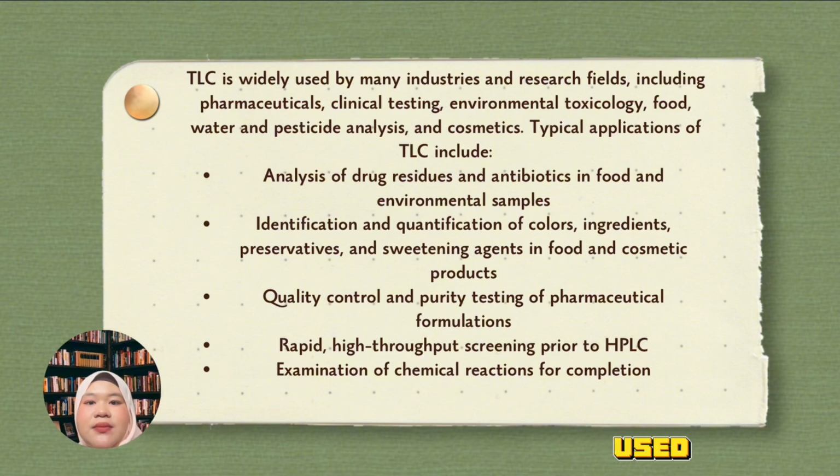TLC is widely used by many industries and research fields, including pharmaceuticals, clinical testing, environmental toxicology, food, water, and pesticide analysis, and cosmetics. Typical applications of TLC include: first, analysis of drug residues and antibiotics in food and environmental samples. Second, identification and quantification of colors, ingredients, preservatives, and sweetening agents in food and cosmetic products. Third, quality control and purity testing of pharmaceutical formulations. Fourth, rapid high throughput screening prior to HPLC. And lastly, examination of chemical reactions for completion.